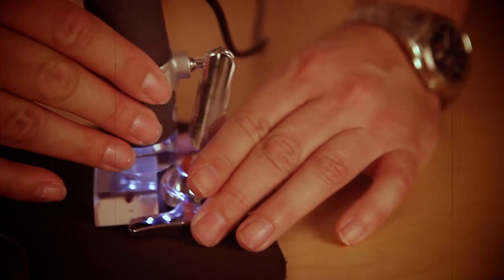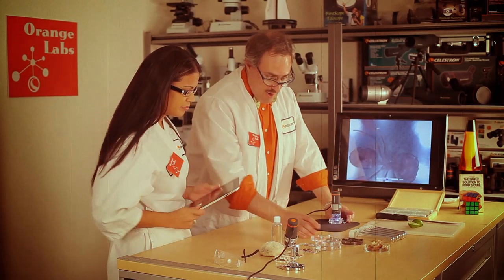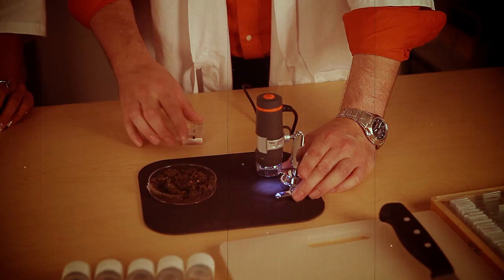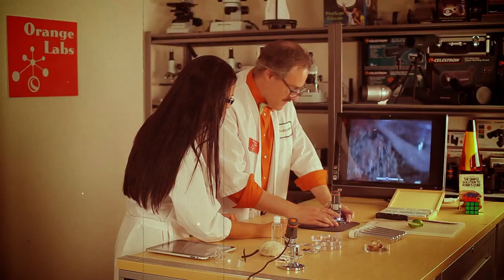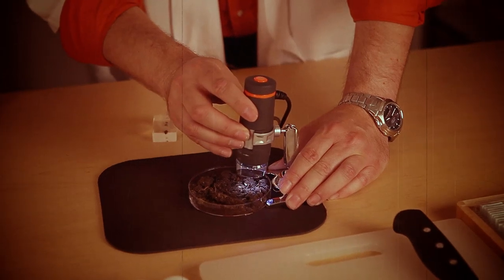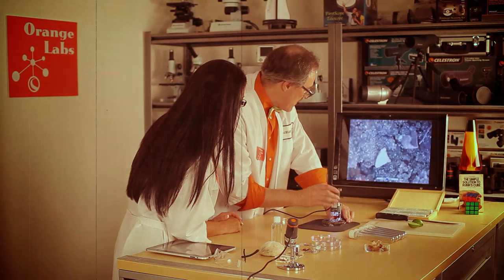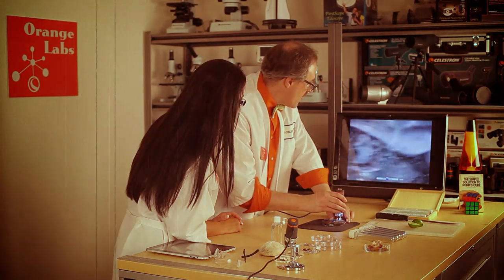This is really fun. I bet I could look at some other fun stuff too. Why don't we look to see if we can find some things? I think I have some dirt that I knocked off my shoe this morning — I wonder what that looks like under this. Wow, look at the tiny crystal. What is that huge thing? Looks like a leaf. But a leaf is a little tiny thing. This is huge!